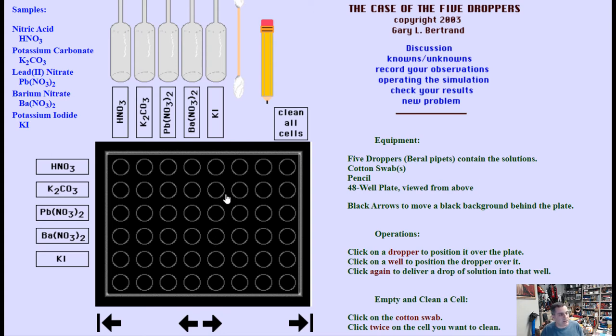First thing you do before anything else, then you're going to come over here and pick one of these droppers. It doesn't matter which one you pick, we're just playing around right now as a demo. You can be more thoughtful when you actually get into the activity. I'm just trying to show you what's going on here. We'll grab some potassium carbonate. You're going to click one time on the little pipette.